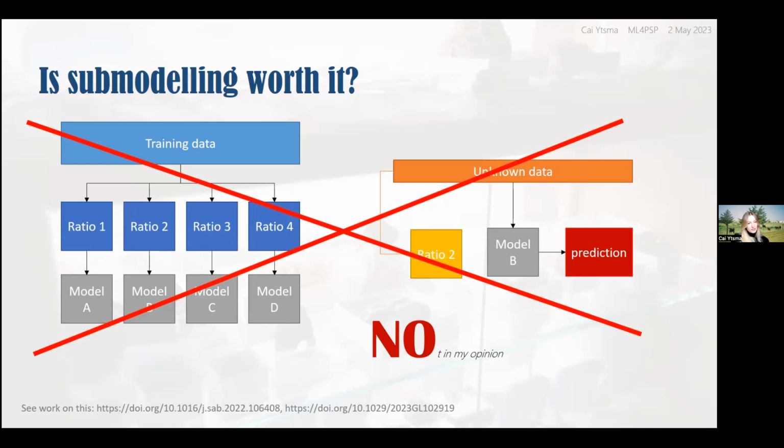So actually, my coworker Kate has put out 2 really interesting pieces of work looking at this, linked on the slide. Splitting by silica ratio, silica concentration, seeing if that works, didn't. And also combining a bunch of different laser power data into one massive model, and it did better than if you separate by laser power. So it's really convincing that more data are better. If you can get them, put them all together and let the machine learning do the trick.